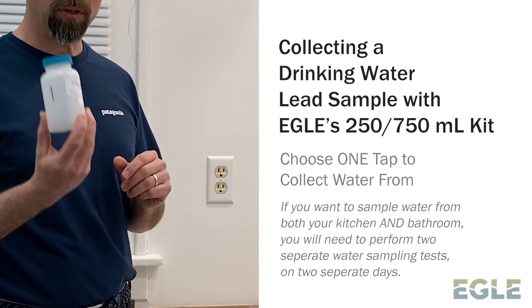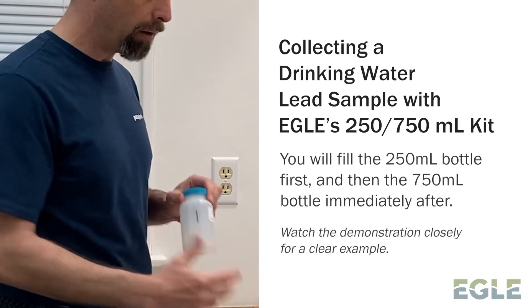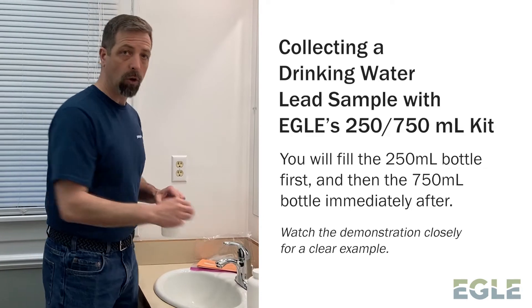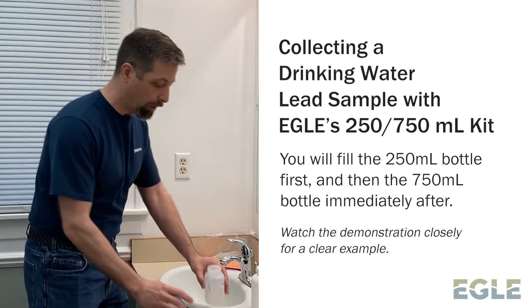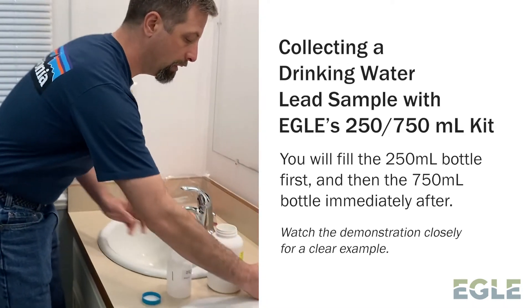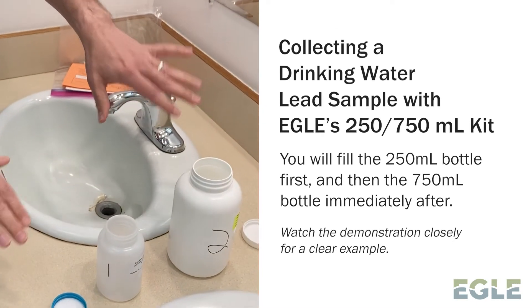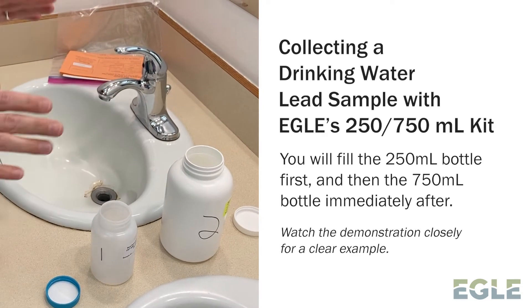The very first bottle you fill up is going to be your 250-milliliter bottle, then you're going to follow that with your 750-milliliter bottle. This goes pretty quick, so you want to make sure that you have your stuff set up. As you can see, I've taken my caps off my bottles and set my bottles and caps aside so that I'm ready to go.